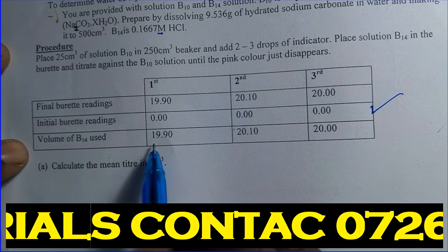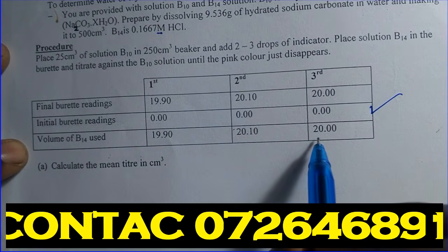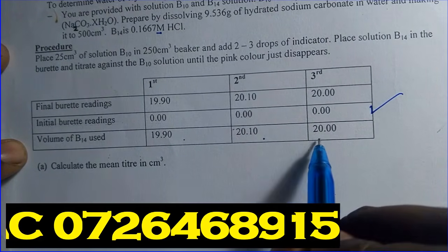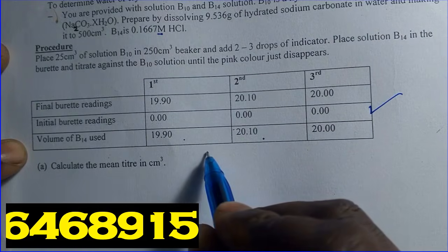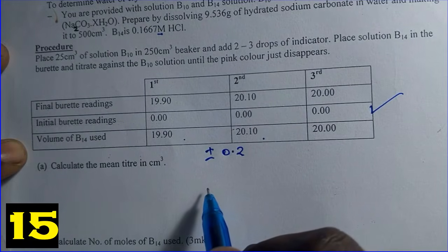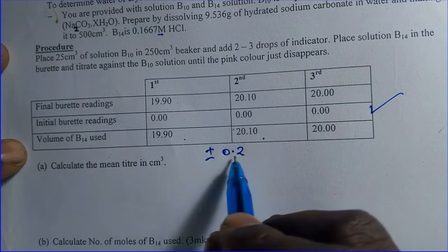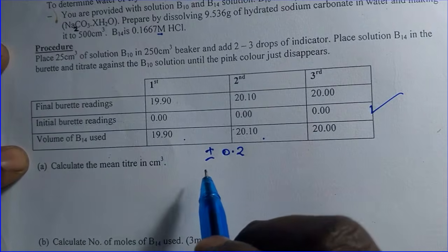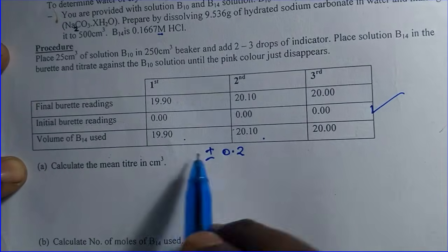Now look at the volume: 19.9, 20.1, 20.0. For you to do the average, the values should be within plus or minus 0.2. If it is beyond, don't use it. If it doesn't range between plus or minus 0.2, then don't use it in the average. Since all of them are within, we can get the average.